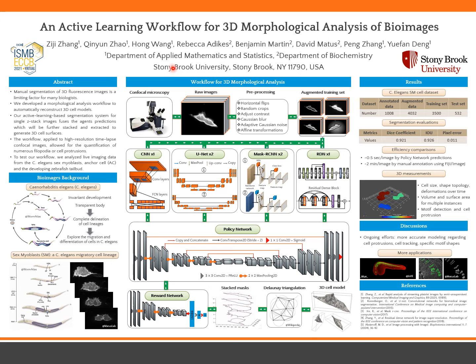Therefore, our active learning-based segmentation and reconstruction workflow is introduced to systematically measure and visualize the downstream cell 3D morphological outputs, and especially to interpret the morphological SM cell protrusions. The complete workflow is presented in this section.